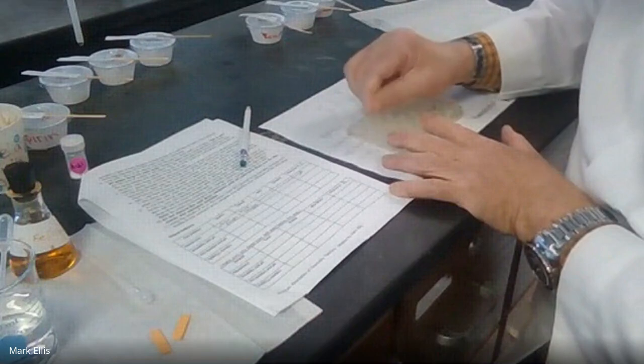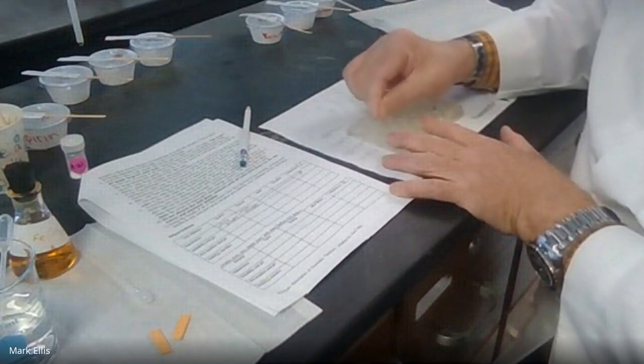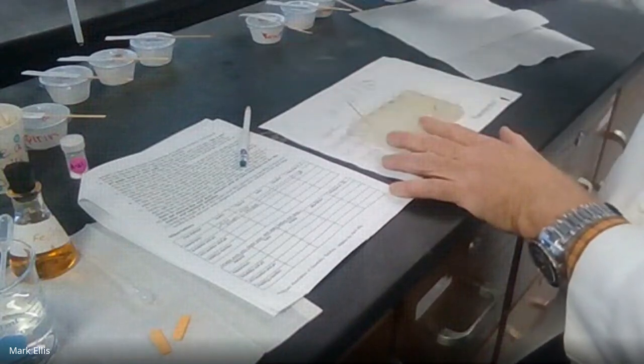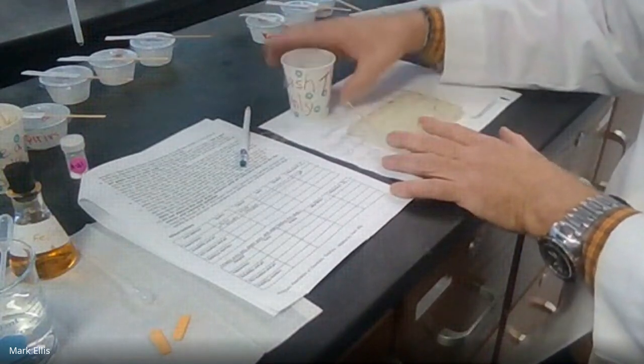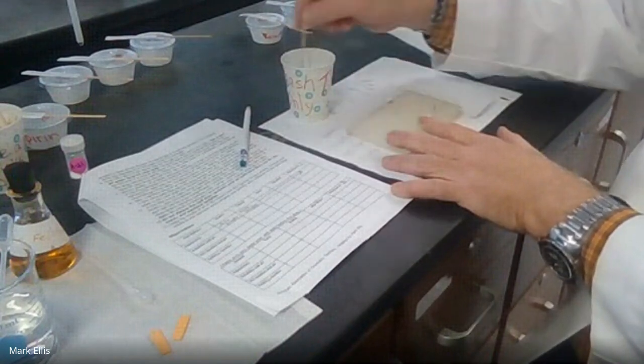And I'm going to give each one a little stir. Stir, stir, stir. You can count to 10 or 20. That's probably good enough. And when I'm done, I want to put that in my trash bin and make sure we don't have any drops that are going to fall out.